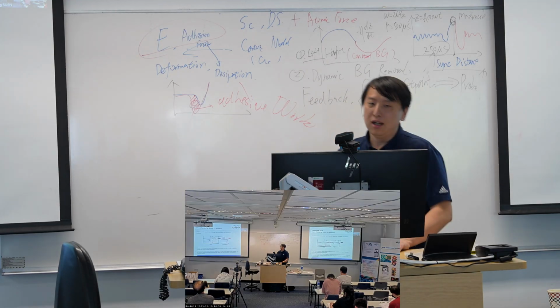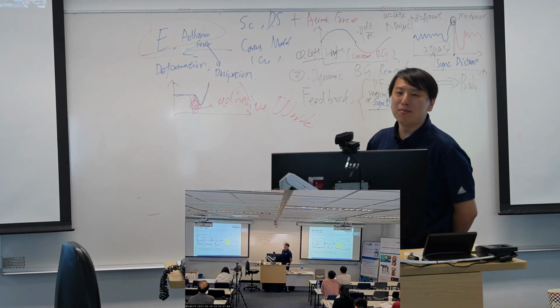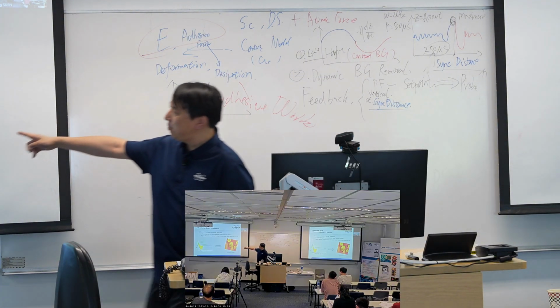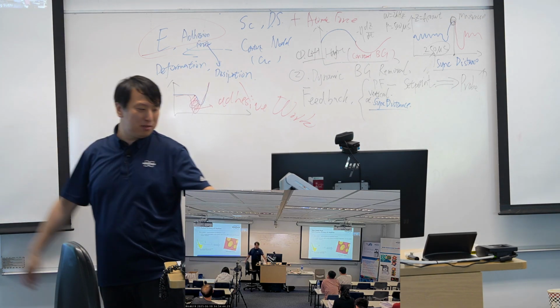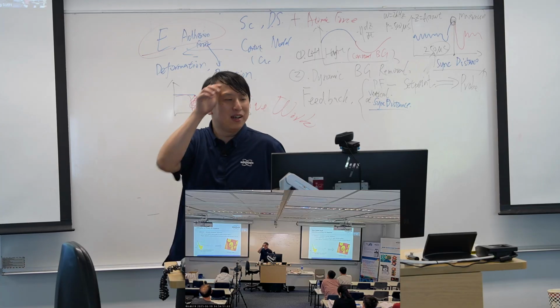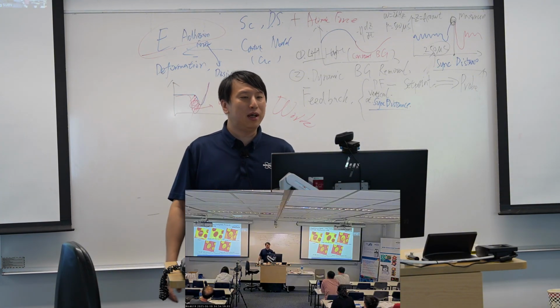From PeakForce tapping we have the so-called PeakForce QNM. QNM means quantitative nanomechanical mapping, and it gives different things. For example, it gives the adhesion force mapping, the modulus mapping, the deformation mapping, and the dissipation mapping. But the useful things are modulus and adhesion, right? So that's the main part of PeakForce QNM.